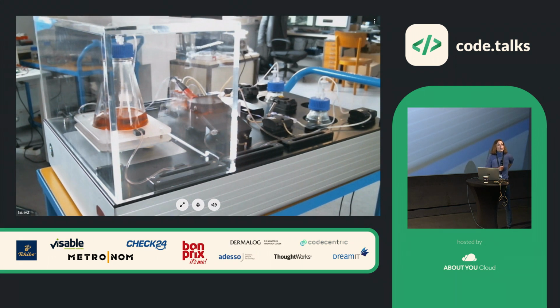If you have scientists in your team that know how to program, can they currently program their own little modules, or are they stuck with the UI? No, here is how it works. You program the module, and you don't even need a UI for that, because you just program. We have microcontrollers in there.